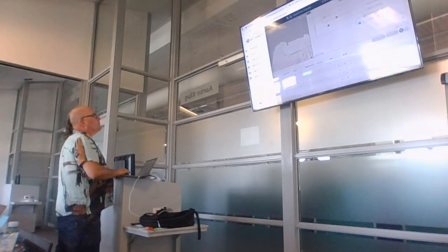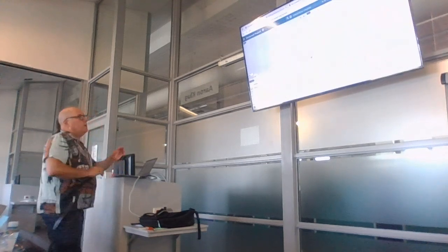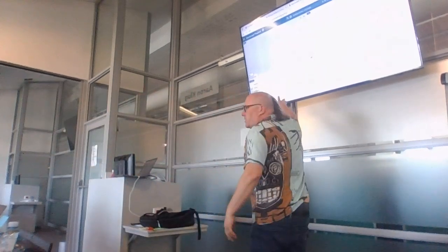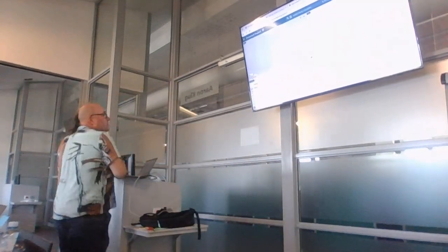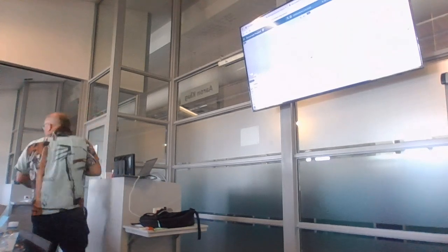No, it's not a time tree, but what I'm saying is that there should be a view down here at the bottom that has cases over time. Oh, I see. I'll have to look at it.